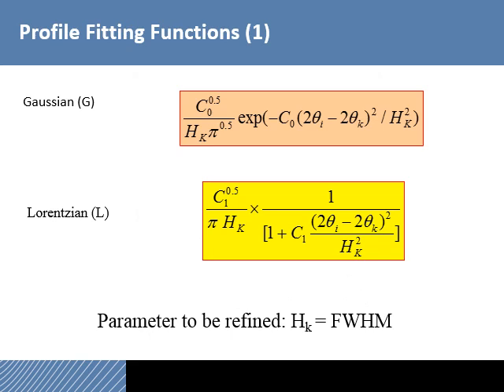So here are some profile fitting functions. The top formula shows the Gaussian function. The bottom one shows a Lorentzian function. In reality, almost all peaks are some combination of the two. All right. We're not going to talk about the equations, but the refinable parameter in these equations, depending on which one you select, is this HK value.